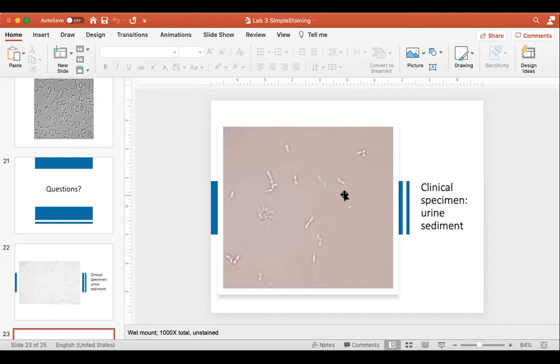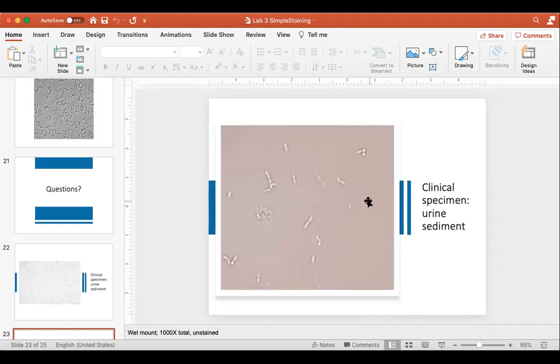So for example, see that circle right there? You would think, oh, well, that's a circular cell. That might be a coccus. Maybe there's two kinds of bacteria here. What you're looking at here is a rod-shaped cell, but we're looking at it end on. So in other words, think about a loaf of bread. You can look at a loaf of bread from the side and you can see all the slices. Or if you rotated it, you could look at the loaf of bread end on and you would only see one slice. That's what happens a lot of times when we examine these microbes.